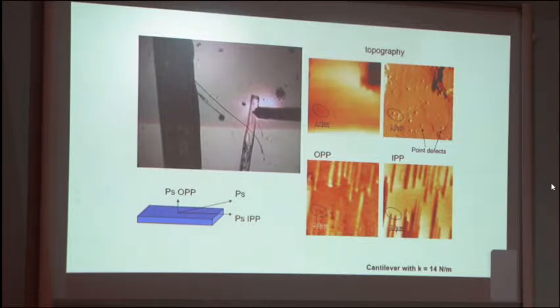It is a problem for atomic force microscopy and piezo force microscopy, because we don't know what the orientation is. It is not possible to determine the orientation locally. There is no method for this.